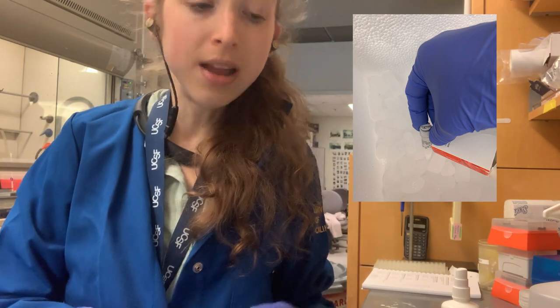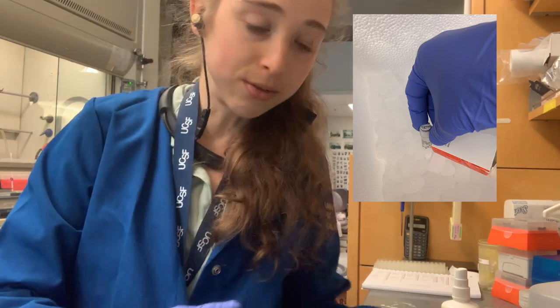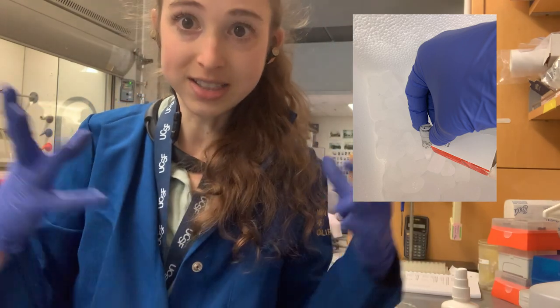Unfortunately when you get them, they're all cold and it's hard to write on. So you have to Kim wipe them off and then write really quickly before all the condensation comes back.